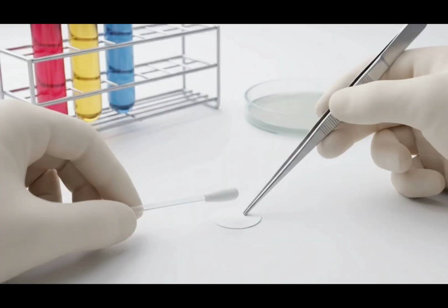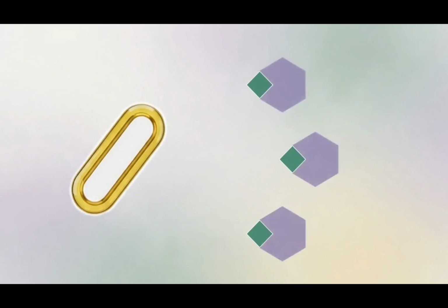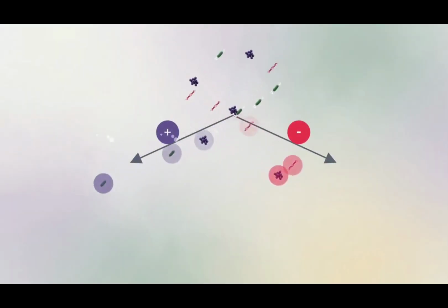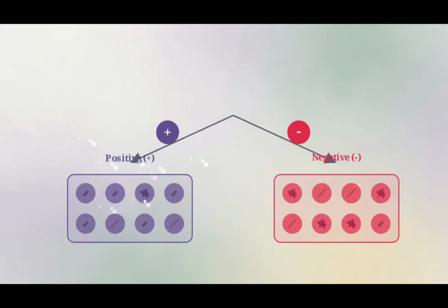Next is the oxidase test. Smear the bacterial colony directly onto a specialized oxidase reagent disc, which contains a specific electron donor compound. If the bacteria produces the oxidase enzyme, it will oxidize the reagent. You will see a rapid, unmistakable color shift, turning the sample a deep purple within a matter of seconds. These instant screen reactions act as a crucial first filter. They immediately split your bacterial candidates into broad categories, narrowing the field before we start the longer incubation tests.